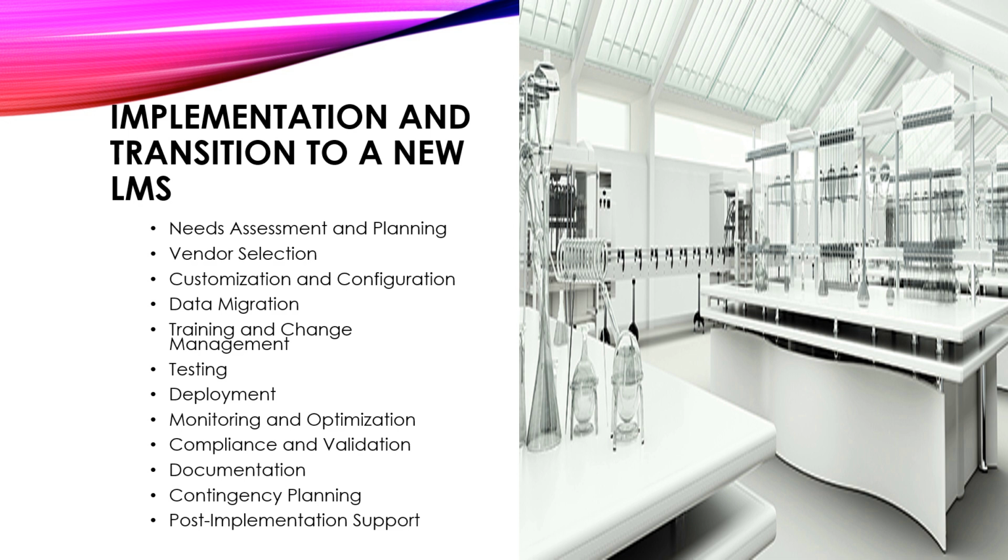Post-implementation support. This is the last but not the least step in implementing and transitioning to a new laboratory management system. Establish channels for users to report issues and request assistance. Schedule regular maintenance activities to ensure that the LMS remains up to date and functional. By following these steps and engaging stakeholders throughout the process, you can facilitate a smooth implementation and transition to a new laboratory management system while maximizing its benefits for your organization.